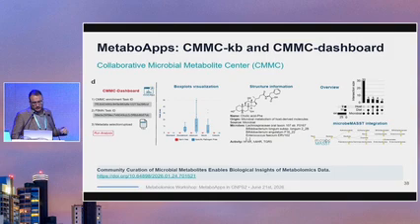And then you can also do a microbe mass integration. As I mentioned before, all the MASST tools are based on the creation of spectral databases, which is ideally, if I'm not mistaken, four of them right now, which is the GNPS itself, the Metabolomics Workbench, the NORMAN, and there's also another one right now.